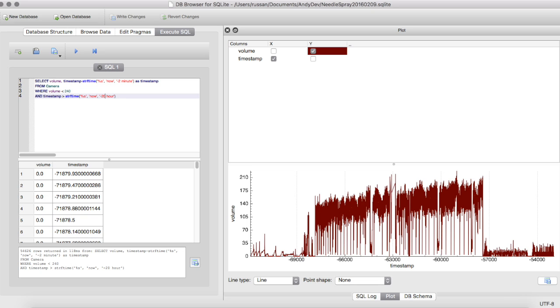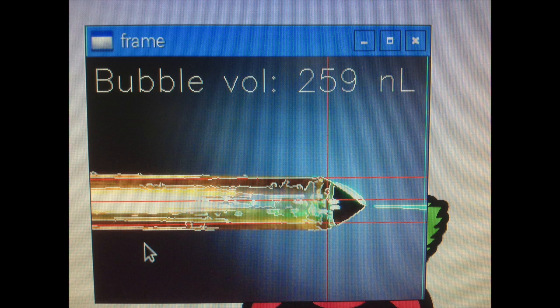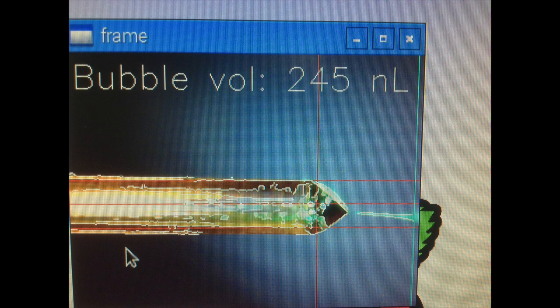Fourthly, we are continuing to notice that the Taylor cone direction is highly variable. We noticed this, of course, in the initial experiments with the droplet spraying off the droplet on the end of the needle, and that's yet something to be explored. Probably the mass spec instrument will tell us whether or not our data output is actually going to be affected by that or not.